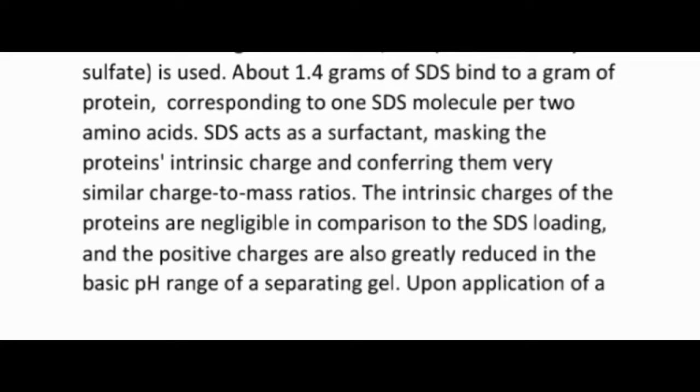In addition, SDS is used, about 1.4 grams of SDS bind to a gram of protein, corresponding to 1 SDS molecule per 2 amino acids. SDS acts as a surfactant, masking the protein's intrinsic charge and conferring on them very similar charge to mass ratios.